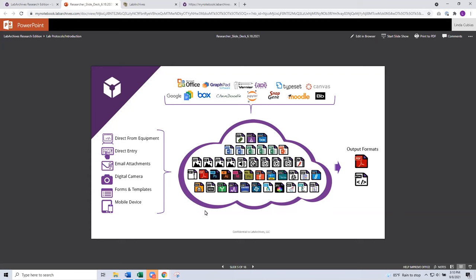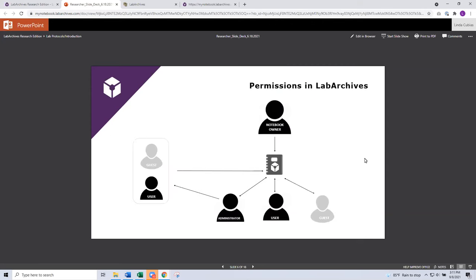Also important to note — you have output options. Once your data is in LabArchives, it is not stuck or trapped. You have the ability to download or output your entire notebook, or even down to an individual entry. Now this is going to be a really important core component — your permissions in LabArchives. These are the different membership roles that we support, and I'm going to give you a definition of those and how you could utilize them in your own adoption of LabArchives.